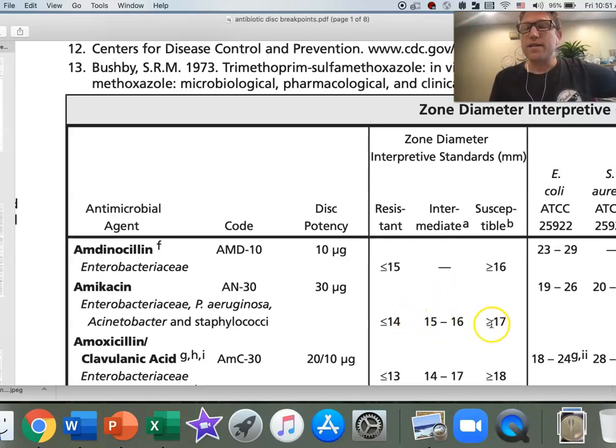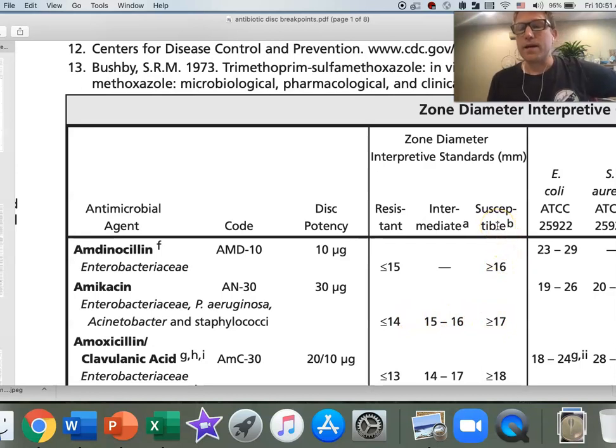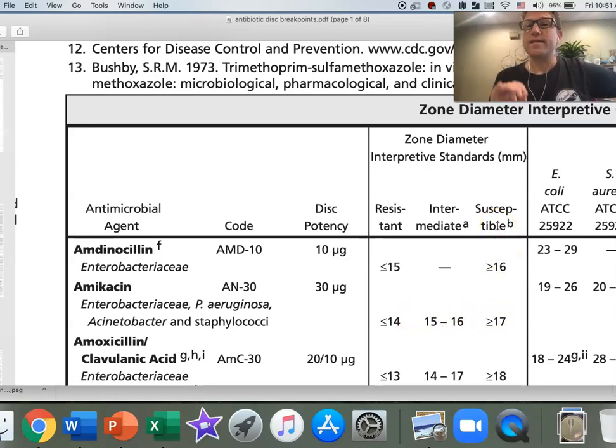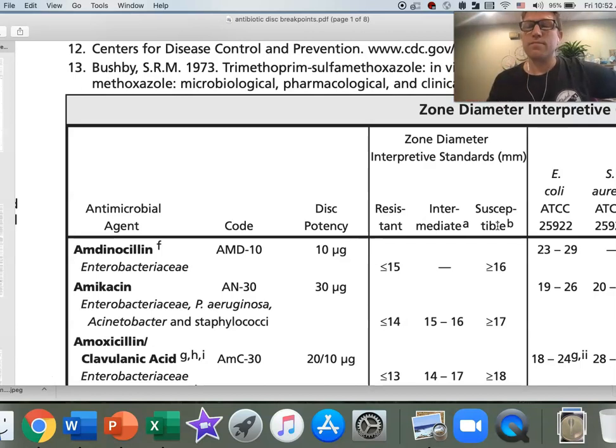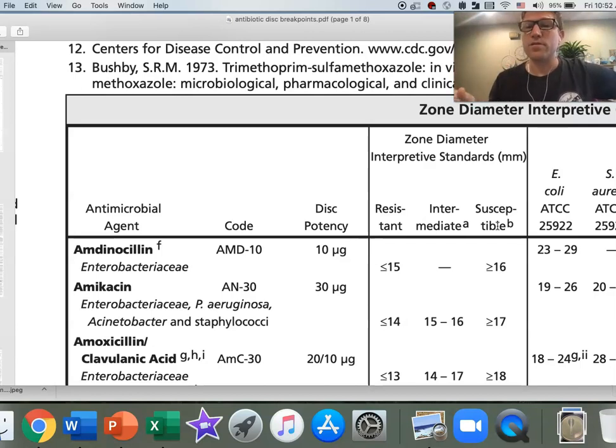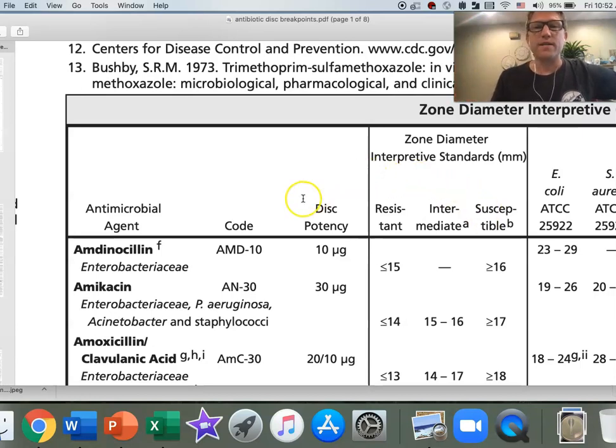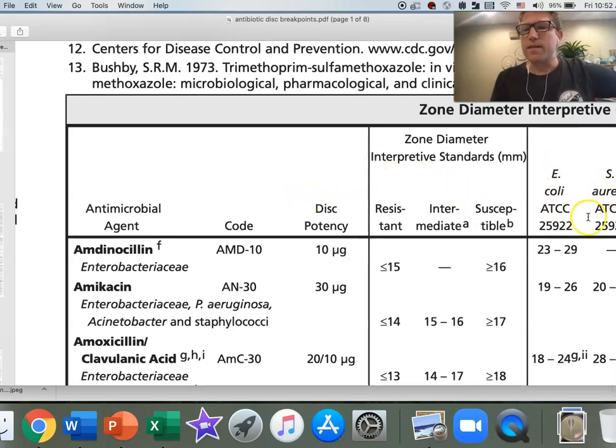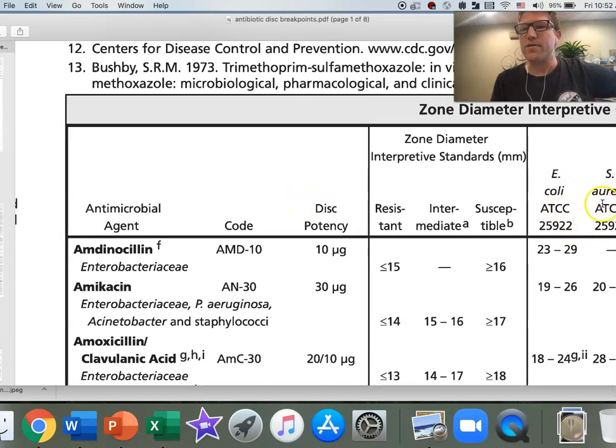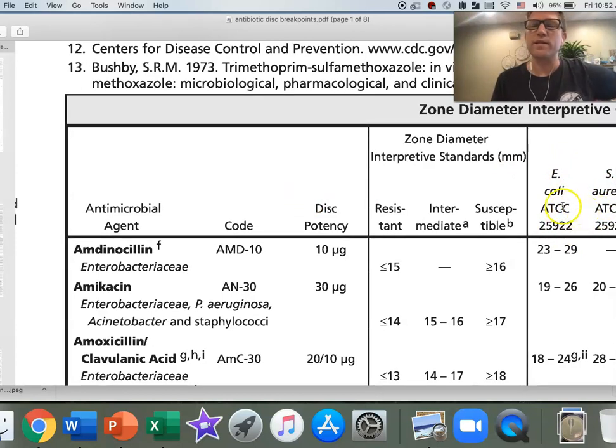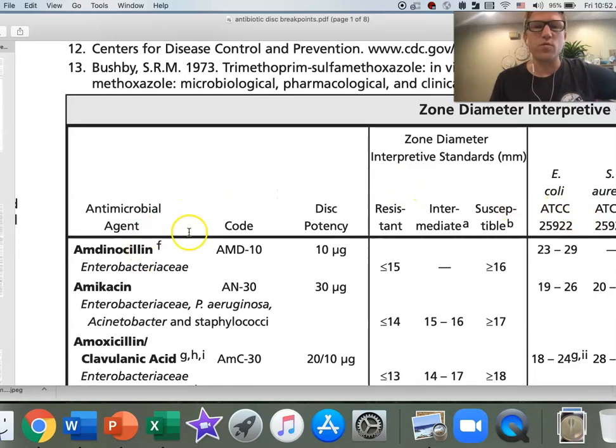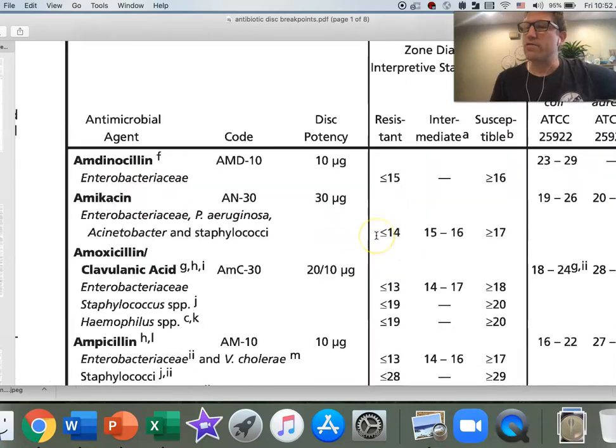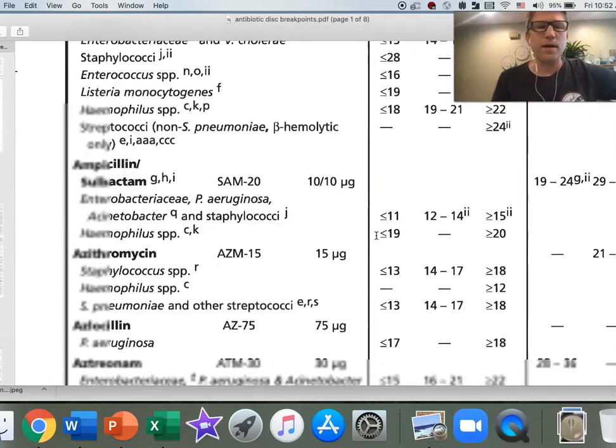It's not necessarily your best choice if you have other options because it's risky. If, however, it's 17 or above, the majority of the time the bacteria are susceptible and a standard dosing regimen, which you can get from your Sanford guide, is going to be effective. Let's go ahead and find our imipenem. Don't worry about these off to the right here. These are standards for quality control, which we didn't do for our experiment.